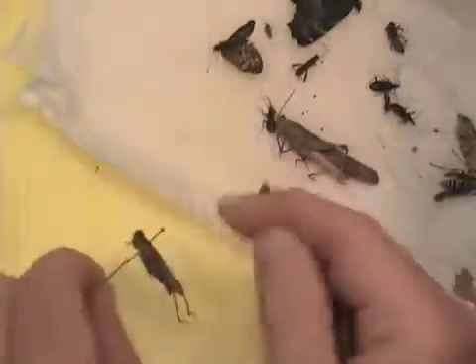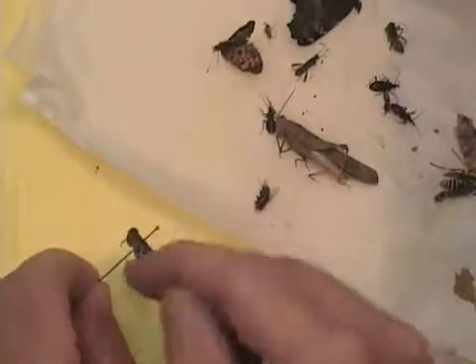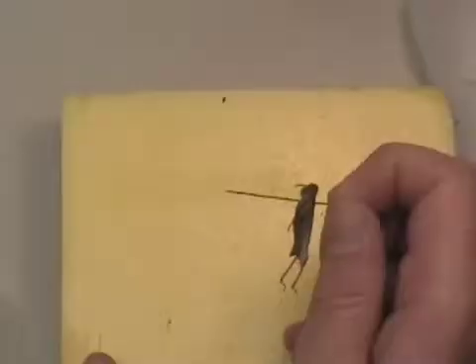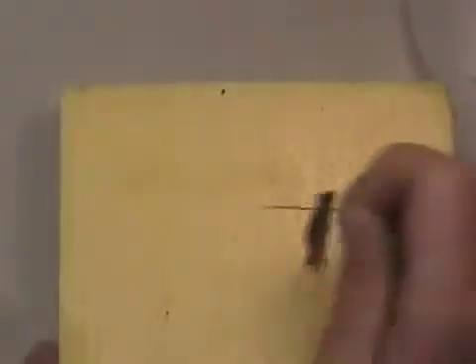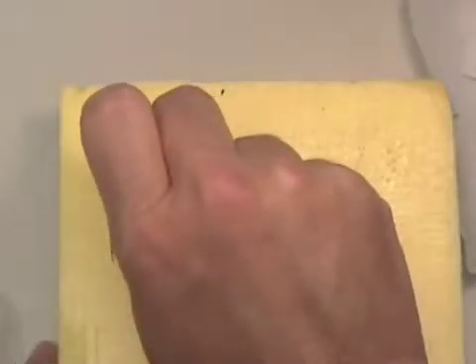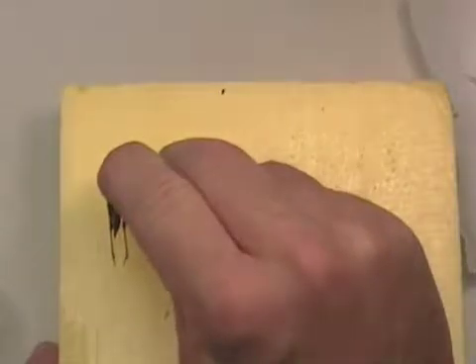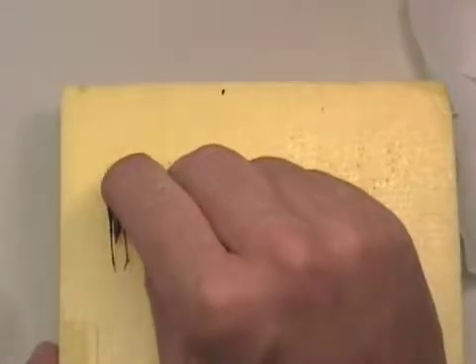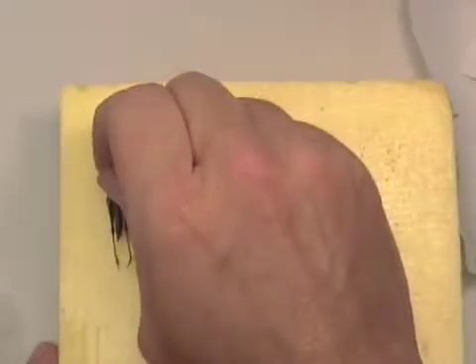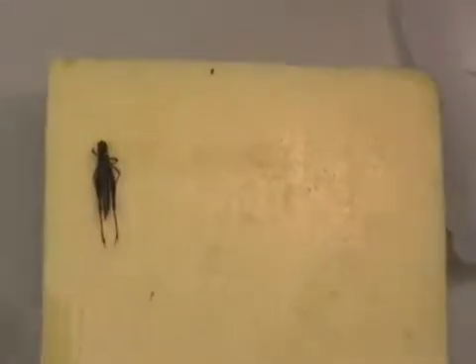Now we have a little handle up here. All the insects will be at the same height. We then will take this insect and use this styrofoam block and press to help position our legs so that it's easier to identify them. We're going to push the insect right down flush to the surface of the styrofoam.